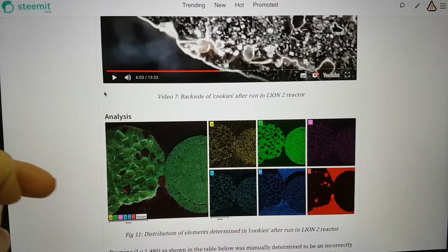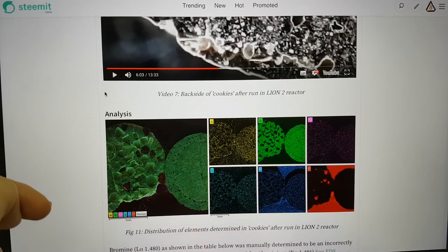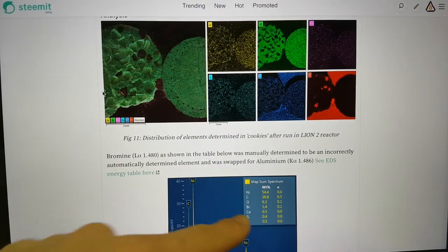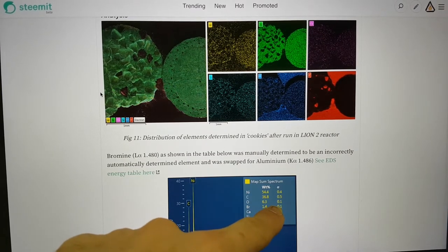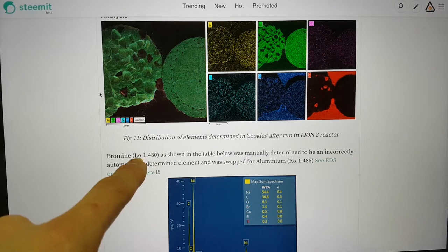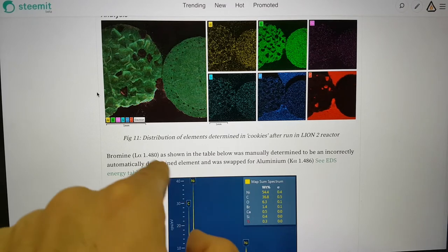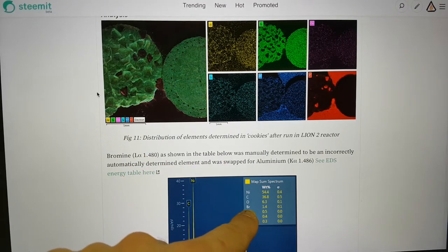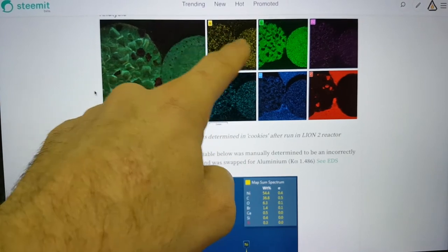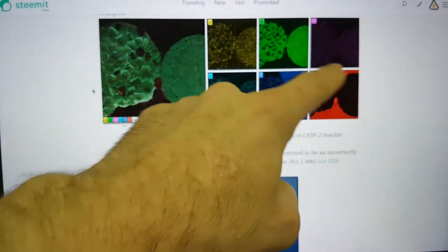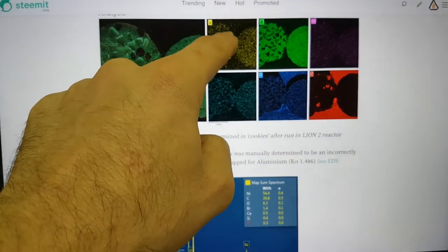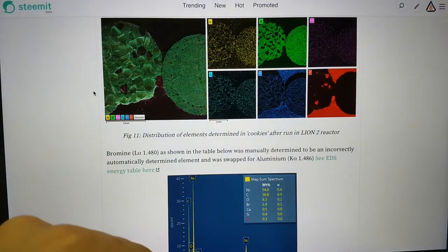Here's a chip, a cookie with just a few chips in there of diamond. As you would expect, it has nickel and carbon. But it would also appear that there is a sprinkling of what first appeared to be bromine, but it was because of an automatic analysis misdetermination between bromine's L-alpha and the aluminum's K-alpha line, which are quite close. Please ignore this BR, it's actually AL and we corrected it for the map image.